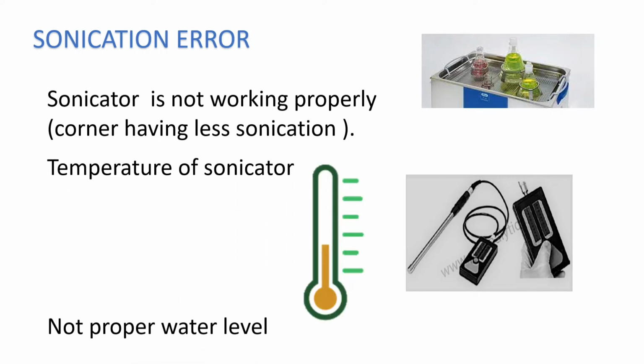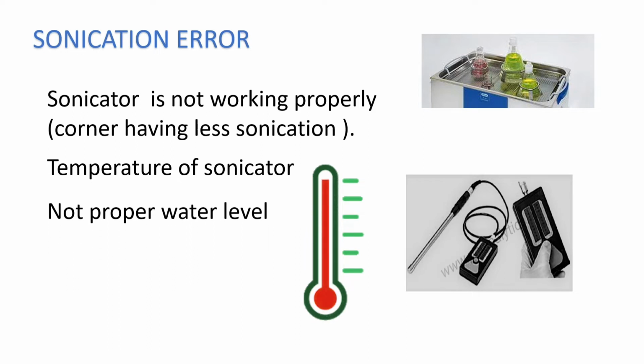Then another is the temperature of the sonicator. Some sonicators are attached with a cooling system, so they can maintain the temperature. But some sonicators are not attached with a cooling system, so they cannot maintain the temperature. If you start the sonicator, after some time the temperature of the water increases, which can also impact your sample.